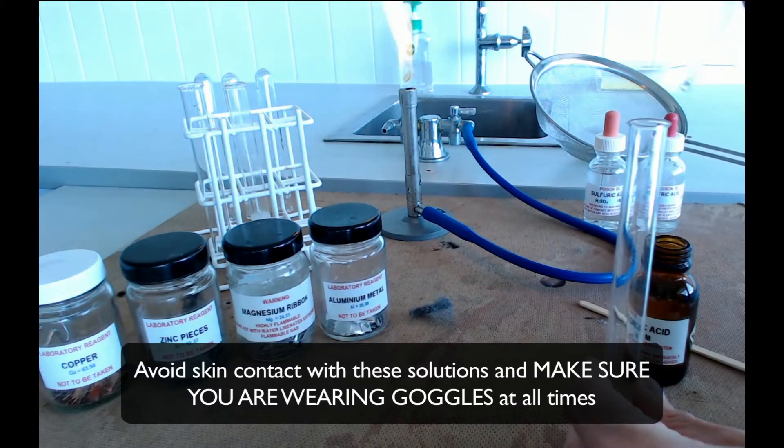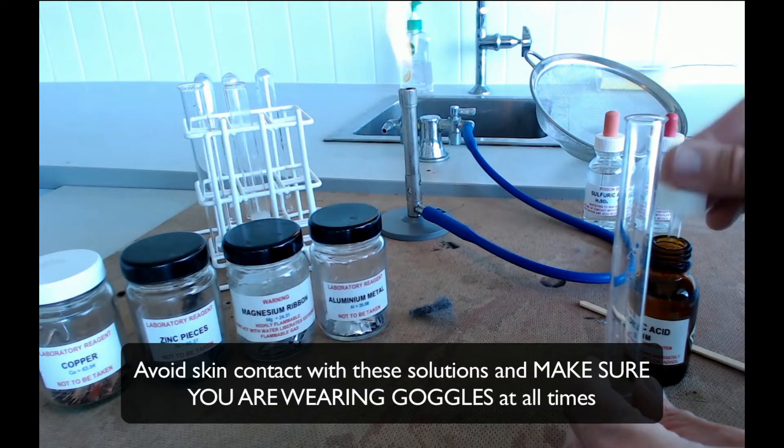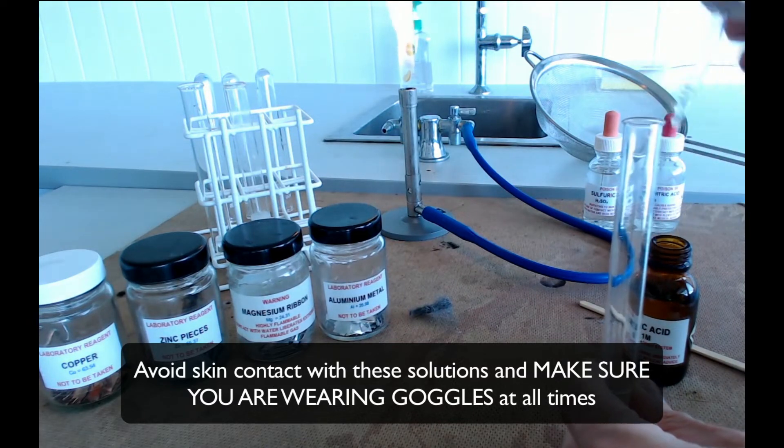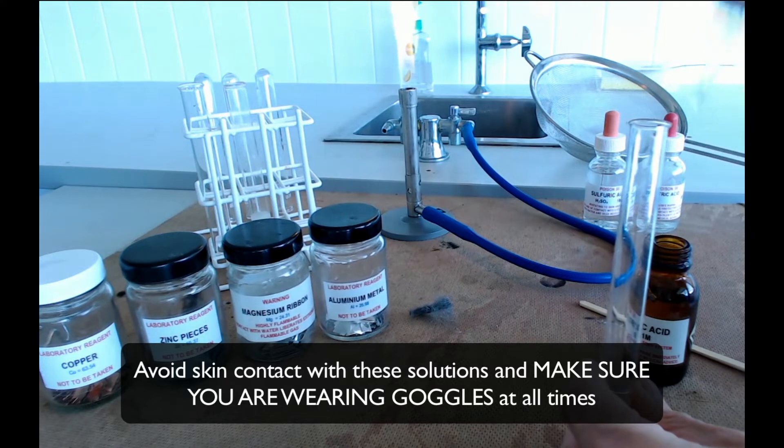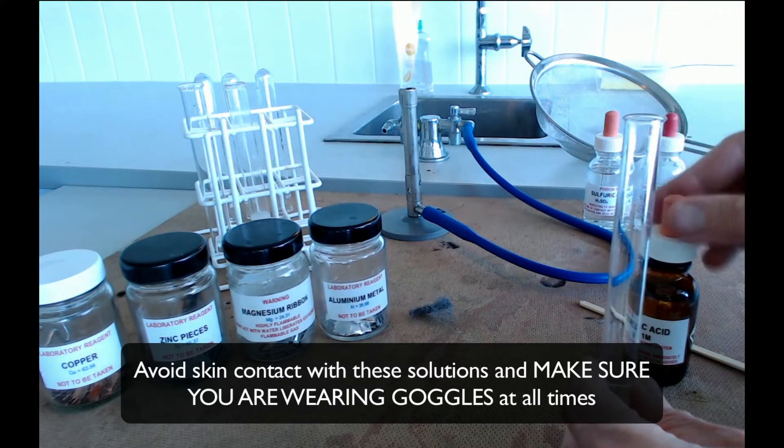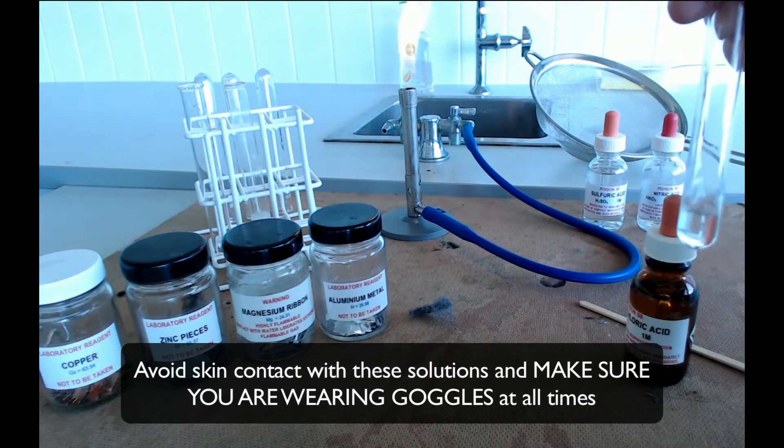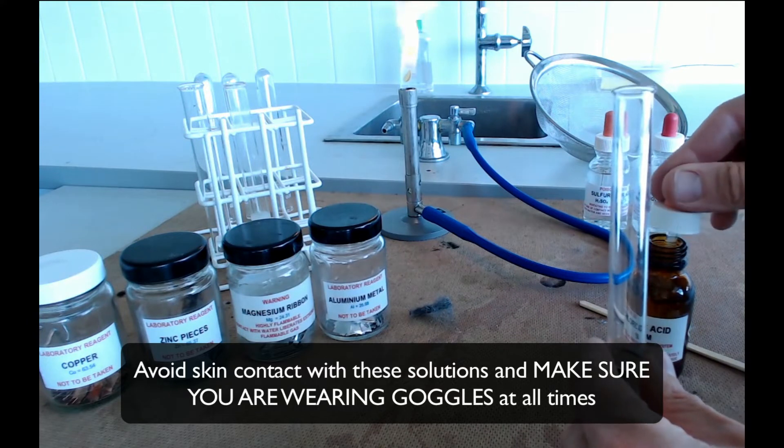So a good guide to how much to take would be once you've got about a two finger depth inside your test tube. So if what you've got in your test tube is about two fingers deep then you've got enough acid.